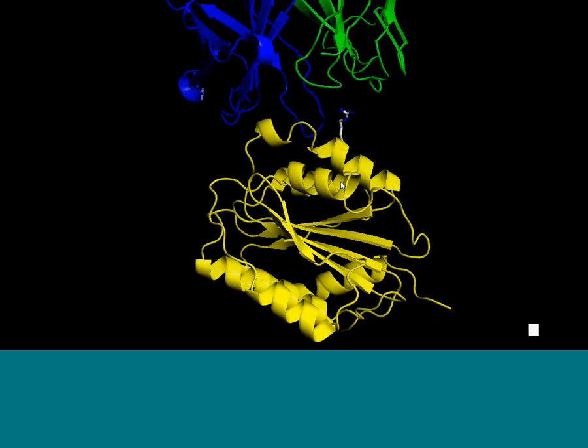So I can't speak to that from direct experience, but my colleagues have had pretty good success with other antibody capture strategies. But I would add that they're not doing the kind of throughput that we're doing. We really want to be able to do something where we can run the Proteon for days to do a whole bunch of different stuff, and we don't want to have to make a new chip and put a new chip in the instrument. We don't want to have any concerns about chip-to-chip variability. We want to run all of our experiments on one chip. So I prefer this method.